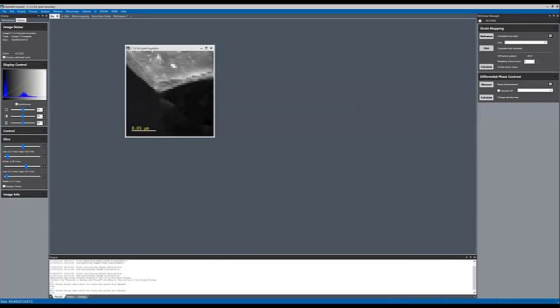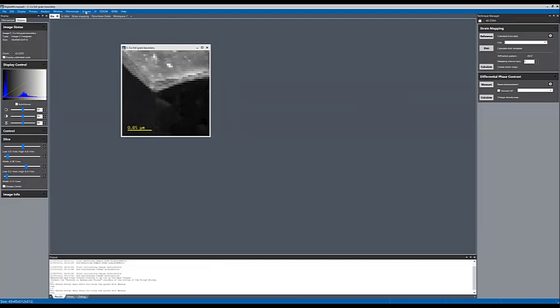You can do further reduction under the STEM SI setup window. That will be software reduction. As you're acquiring the data, it also bins them additionally before it stores them. But if you want to do so afterwards, after you collected your data, you can do that here under volume. So you can rebin all of the 4 dimensions in your data cube.